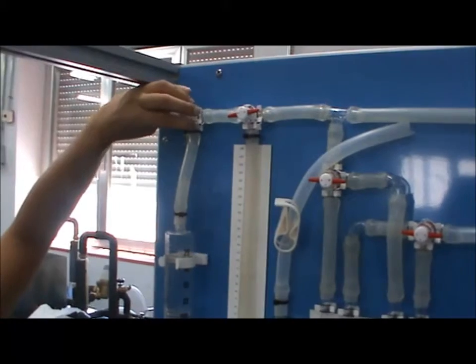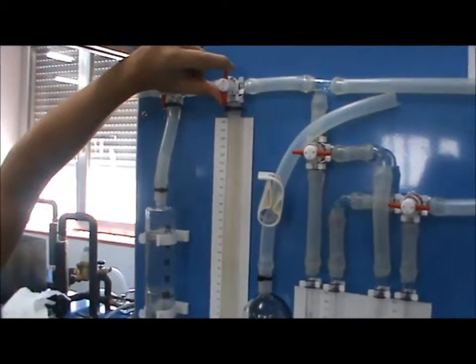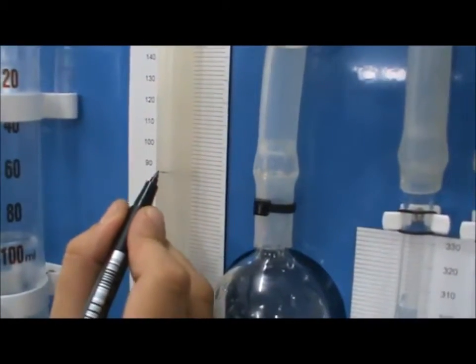Then, quickly open VT3 and VT2, connecting the syringe to the U-shaped vessels. The solution level will drop slightly. Mark the level with a pen when it has stabilized.